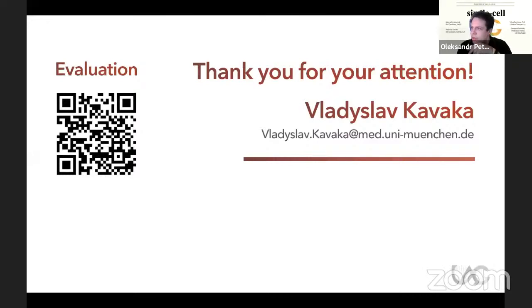Nevertheless, there is one more interesting question, and I will try to find it. Any suggestions related to multiplexing? Would there be any major difference in techniques like CITE-seq and MULTI-seq, which again, I never worked with, to be honest? The question is, any suggestions related to multiplexing? There is also a question regarding two techniques, which I will put in the Zoom chat: CITE-seq and MULTI-seq. Any major differences?